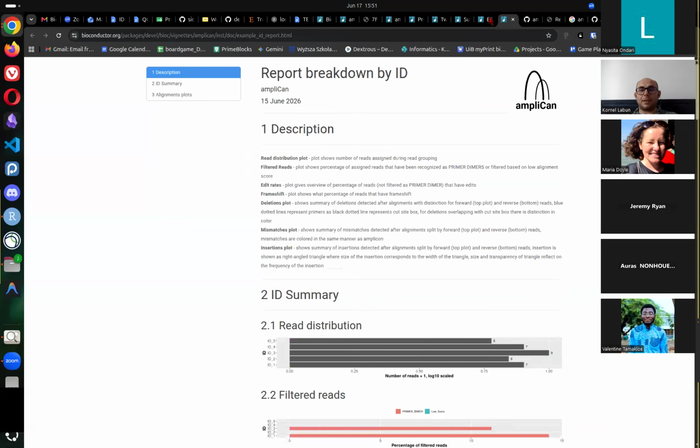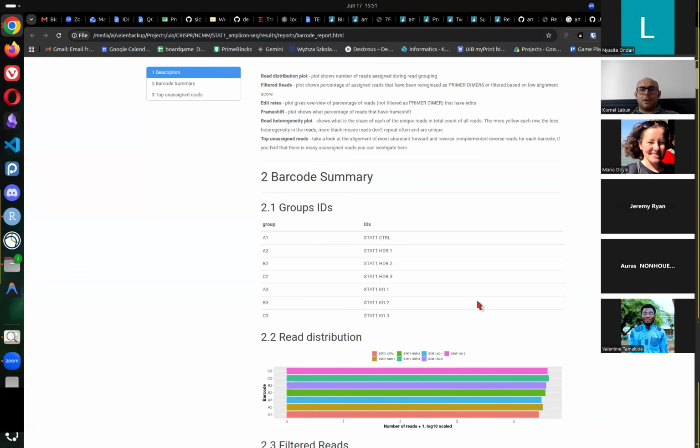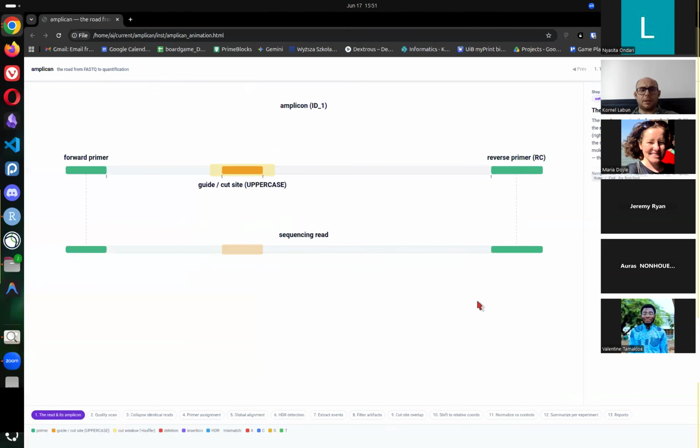How does it look for our example? Did it load? No. I think this is some Bioconductor issue, maybe. Okay, going back to this presentation. So I think we can understand now what happens with multiplexing.